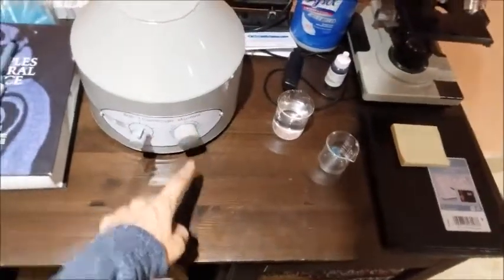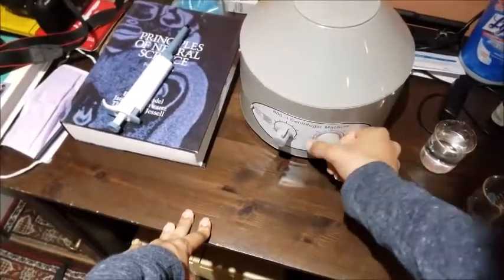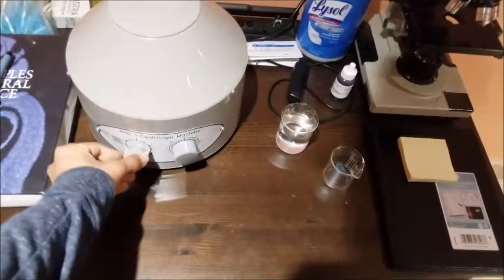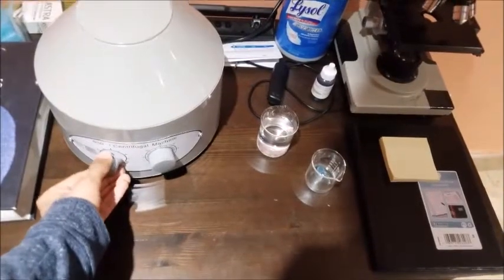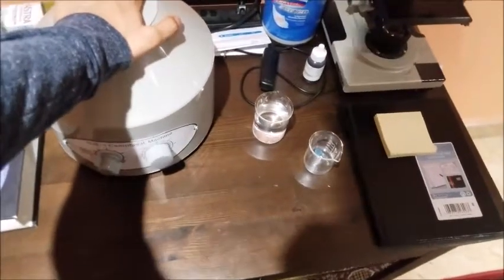This particular centrifuge has a timer function. So if I want 10 minutes, or whatever time I want, I set it to that time. And then I can slowly crank up the RPM all the way up to maximum. It will vibrate a bit, but that's fine — just stabilize the lid with your hand.